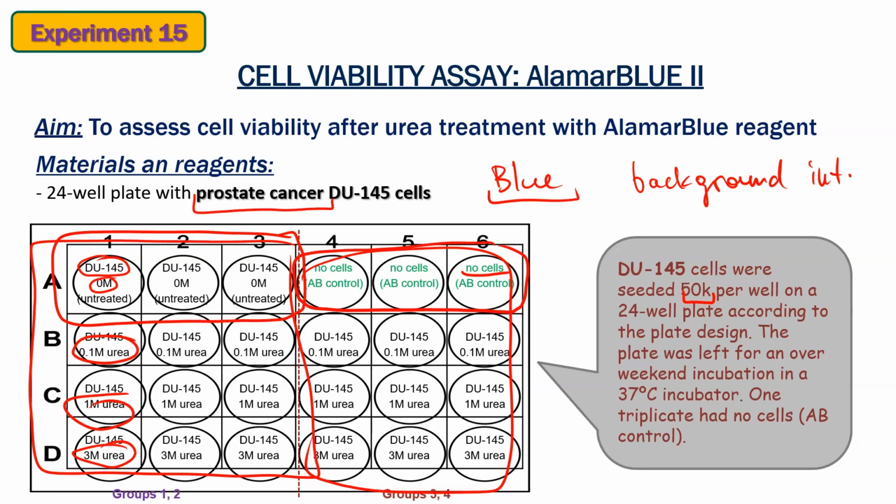So what do you have else? Of course, you are using triplicates because you want to understand the mean, the standard deviation, etc. If you use a bigger plate with a bigger number of wells, you can go more than triplicates, like quadruplicates, etc., up to 9 wells occupied by the same condition. And of course, in this case, the precision of your experiment rises, but the least number of wells per treatment is 3, because in this case, of course, mean is calculated easily.